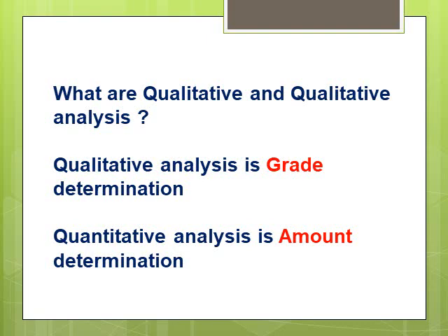Quantitative analysis is simply to determine the amount. So you'd like to figure out how much of this excipient is present in the formulation. The amount is usually reported as percent weight per weight. People who do science in universities or other fields usually report the amount as molar or number of moles.